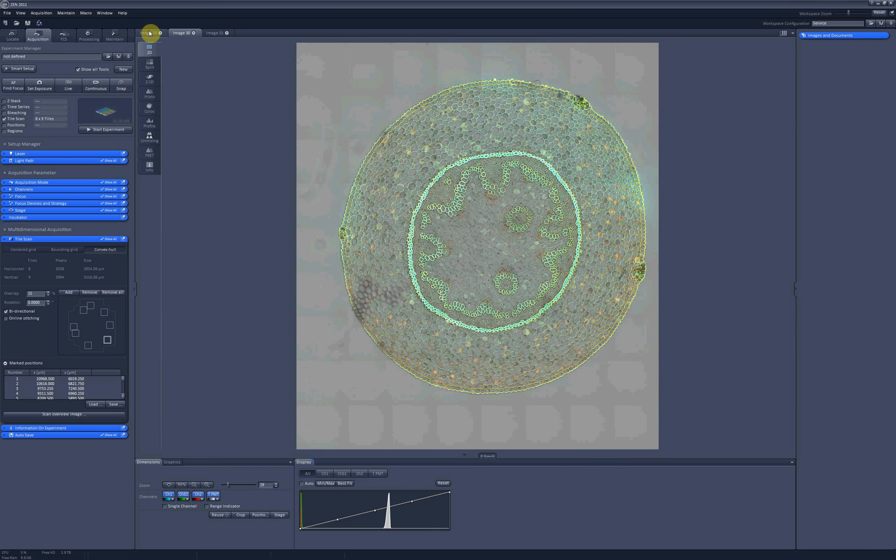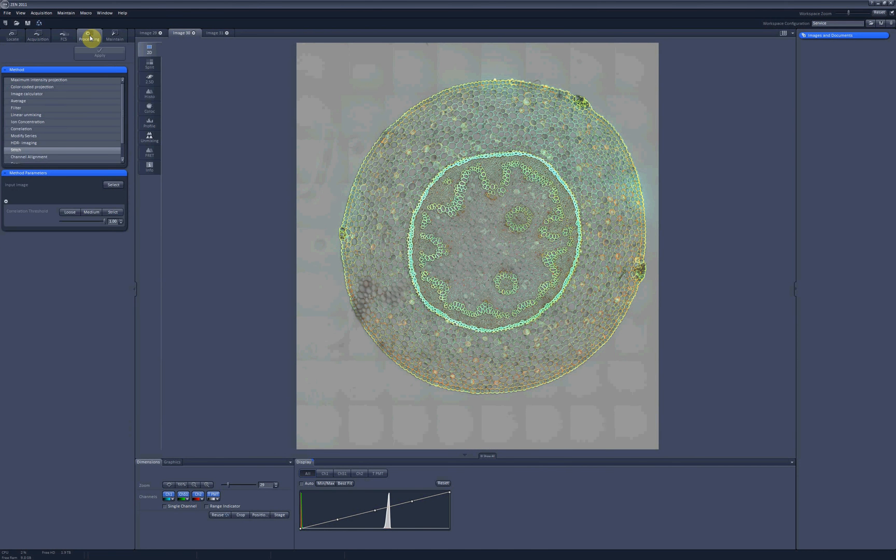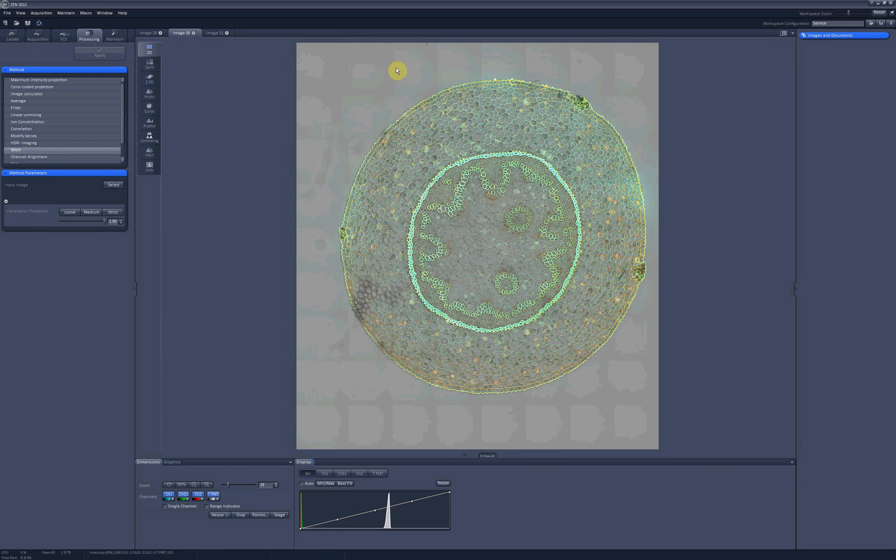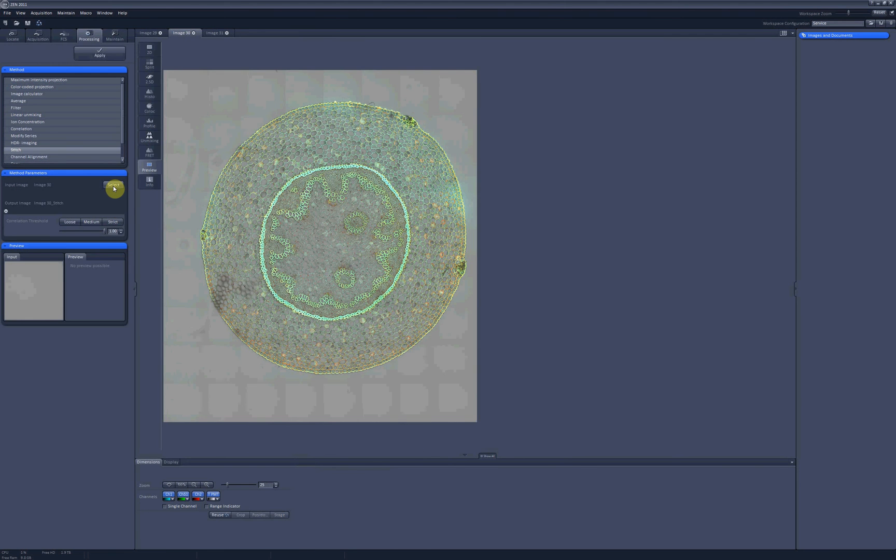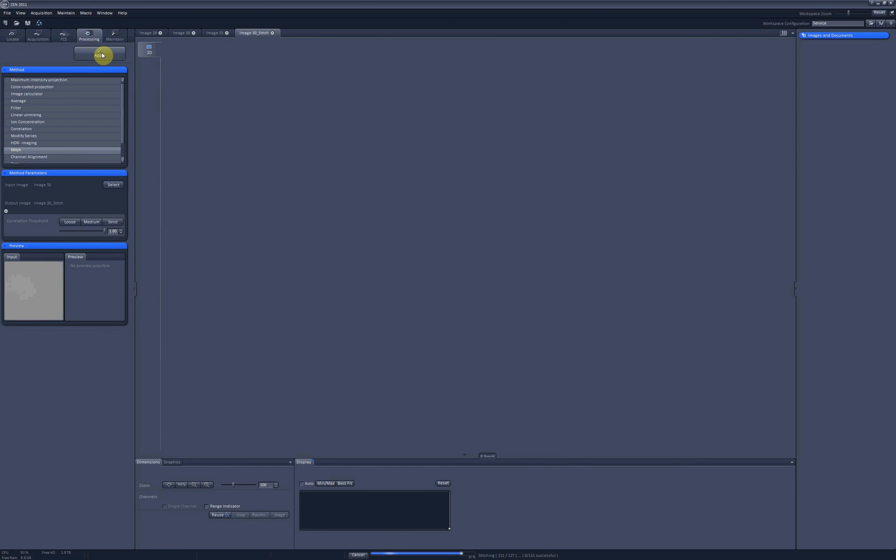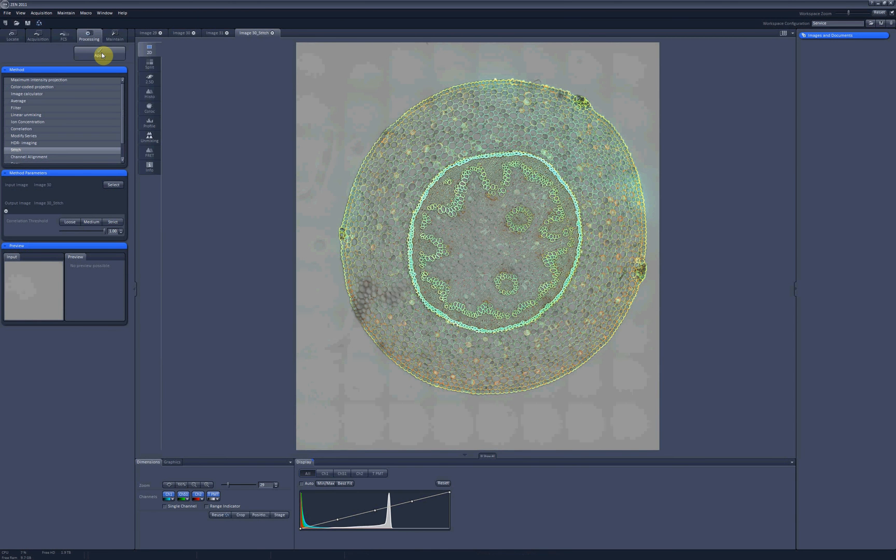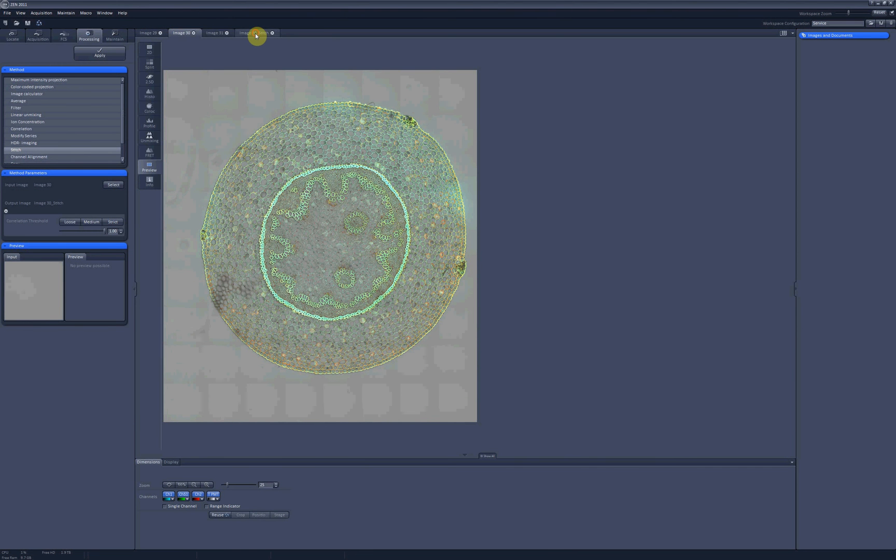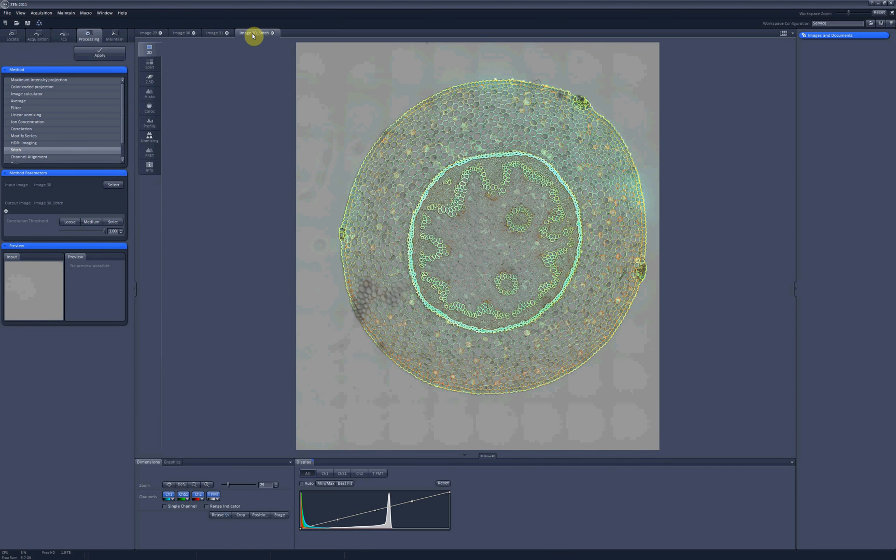When you are done with performing the tile scanning, you can go to the processing tab and select the stitch option. And then stitch your tiles together to get rid of these borders. So you select the image you want to stitch, you select how strict the stitching should be, and then you click on apply.